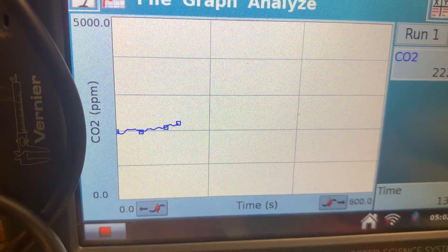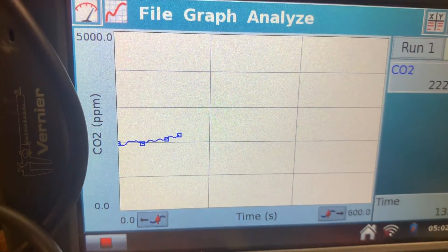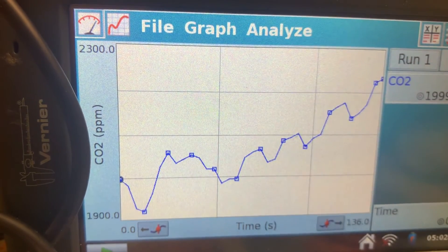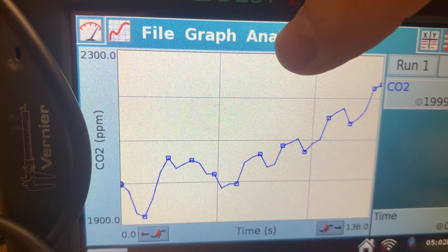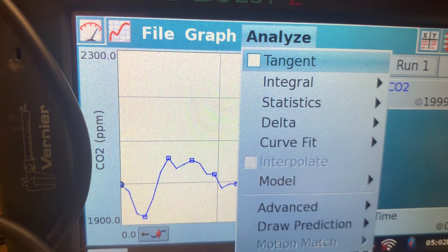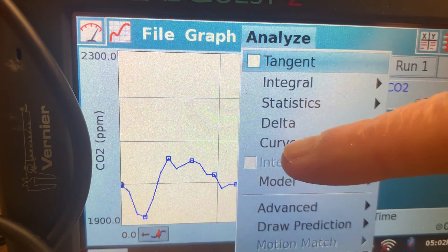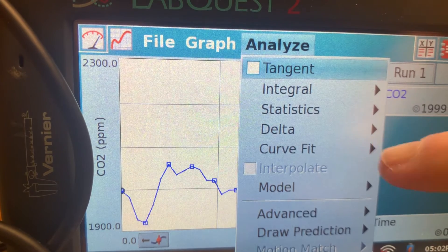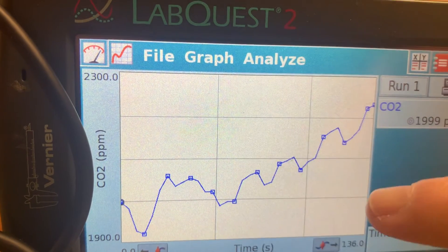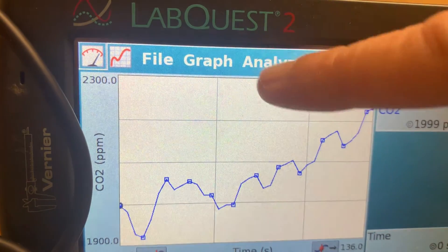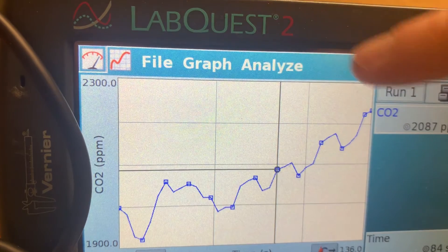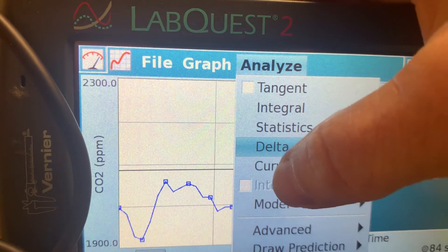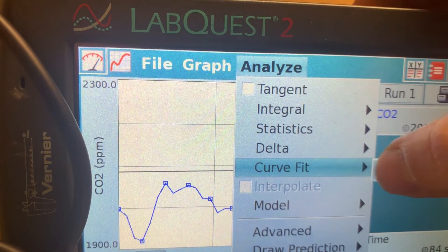When you're done collecting your data, click the red button down here to stop the data collection. Then click the button that says Analyze, and pick Curve Fit.